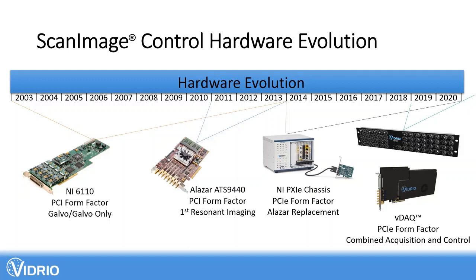We did run into limitations over time, and we tried to work with NI to develop cards that got rid of those limitations, and ultimately we wound up developing our own card, called the vDAQ, and I'll tell you a little bit more about that. We still support the NI chassis and the NI hardware, but we think the vDAQ is superior, and there will be features developed for the vDAQ moving forward that probably won't be possible to implement on the NI hardware.